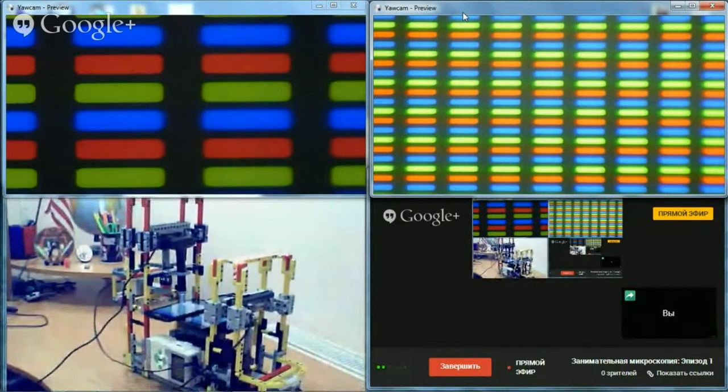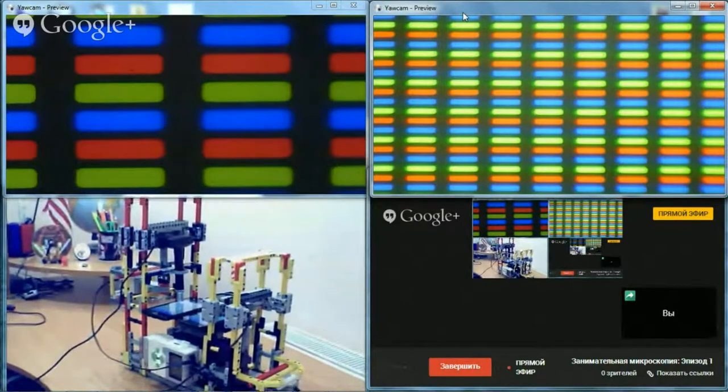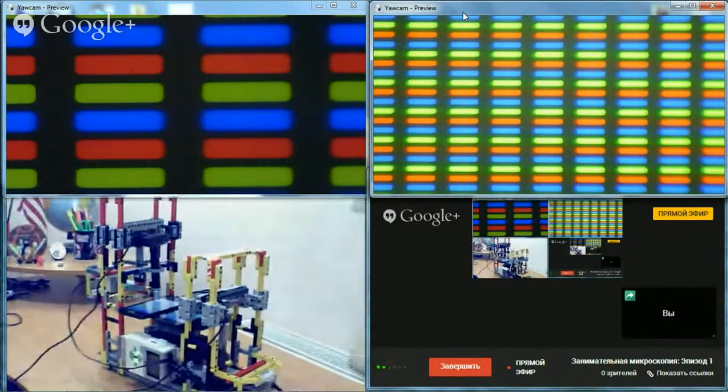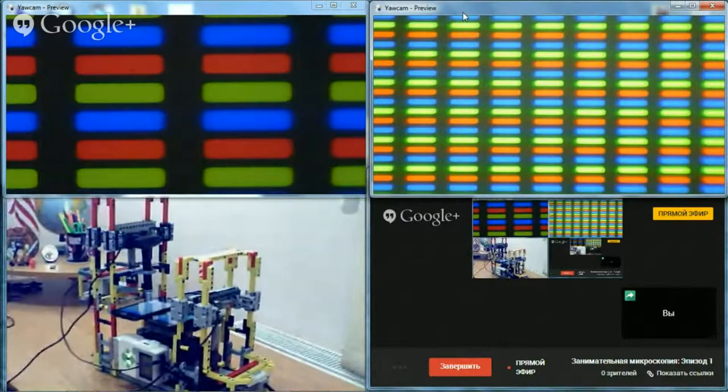The RGB color model is an additive color model in which red, green and blue lights are mixed together in various proportions to reproduce a broad array of colors. Zero intensity of each component gives the darkest color, and full intensity of each gives white.